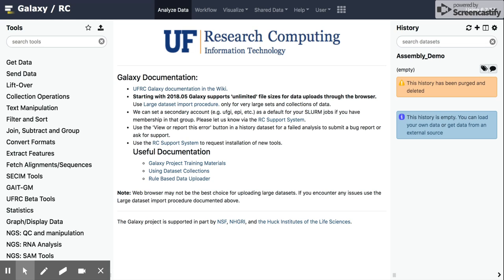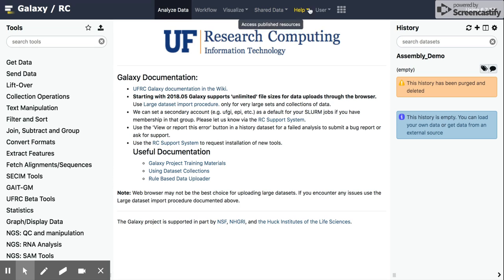So here we are again on our homepage for the UF Research Computing instance of Galaxy. To the right, you can see the toolbar that has the history in it. To the left, we have the various tools that are available in Galaxy. And of course, on our header, these different areas, which we've kind of gone through a little bit.